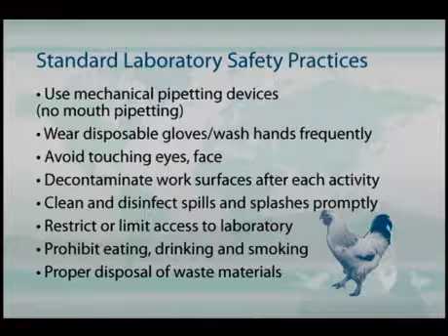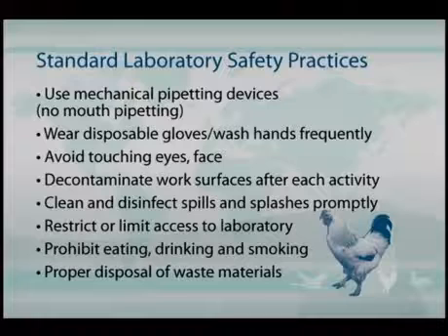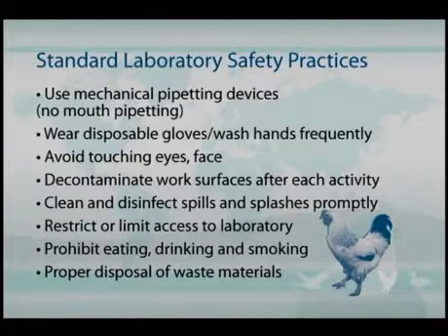Obviously, there should be no eating, drinking, or smoking allowed in the laboratory at all, because this minimizes the exposure of materials through contamination going to the mouth, etc. And of course, proper disposal of waste materials.